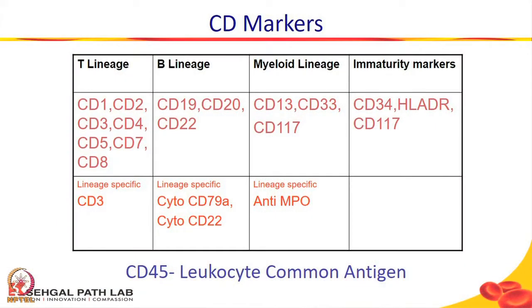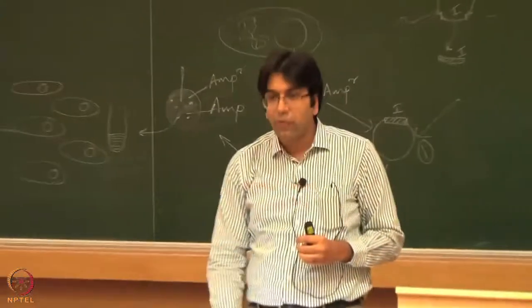And typically we use what we call CD markers, proteins of different cell lines. So you know WBCs or white blood cells, typically basic biology, T cells, T lymphocytes, B lymphocytes. There are some neutrophils or myeloid series of cells. And every cell has their own markers. Okay? We combine these markers into one panel. So there's one tube which will have T cell markers, one tube which will have B cell markers, the third tube will have myeloid cell markers. Run it through a flow machine.